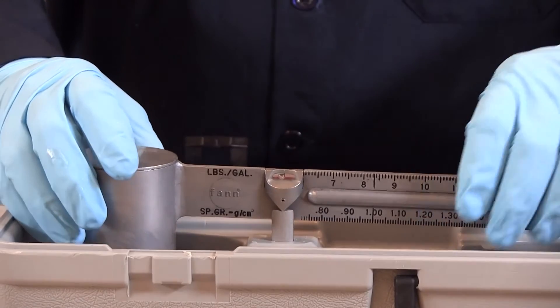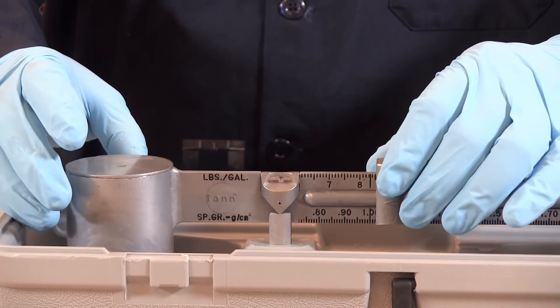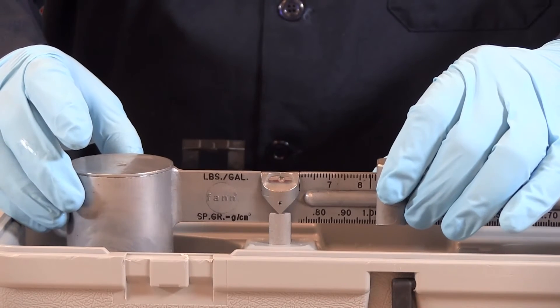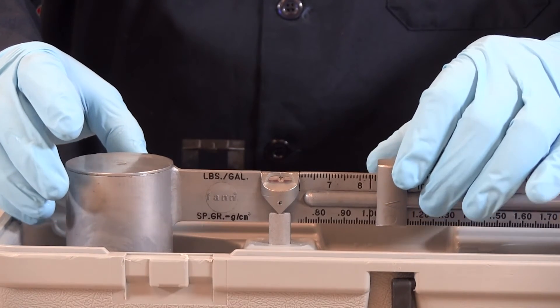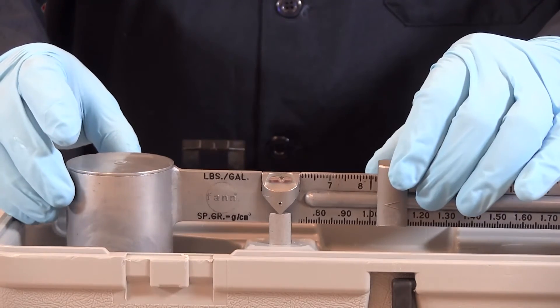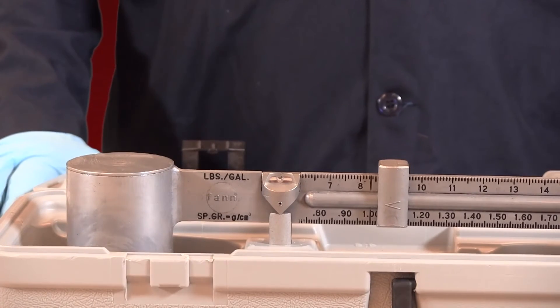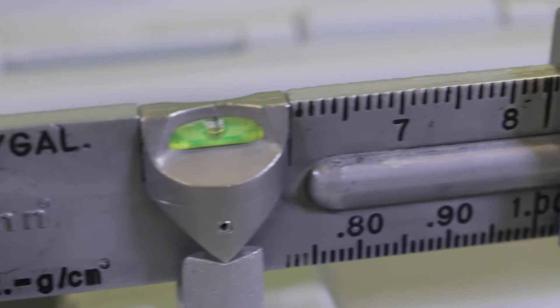Place the beam on the base support and balance it by moving the rider along the graduated scale. Balance is achieved when the bubble is under the center line. Read the drilling fluid density from one of the four calibrated scales on the arrow side of the rider.